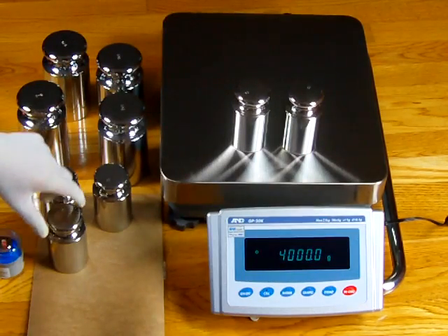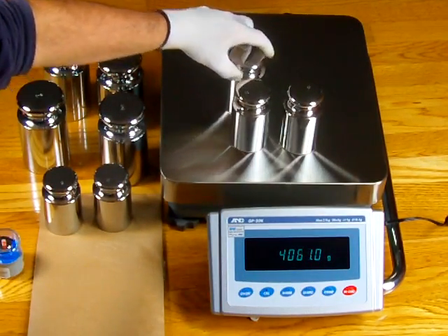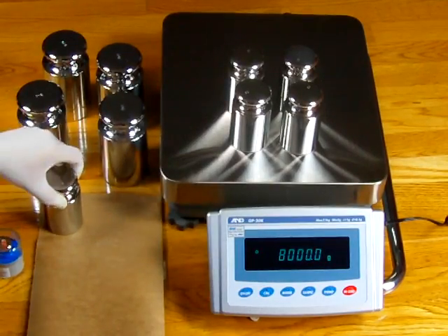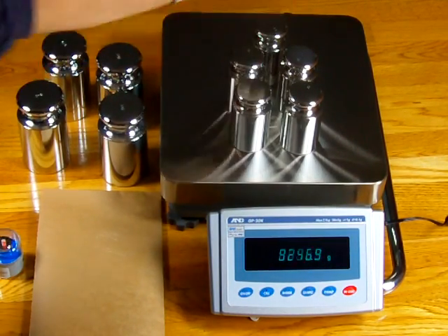This balance is 21,000 grams by a tenth of a gram. And we have some calibration weights — these are ASTM Class 1 certified weights.